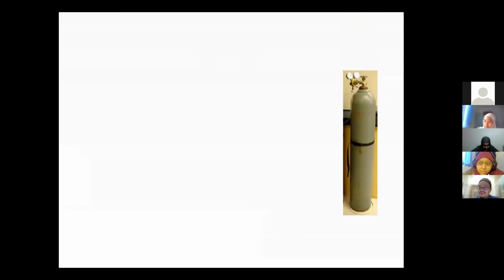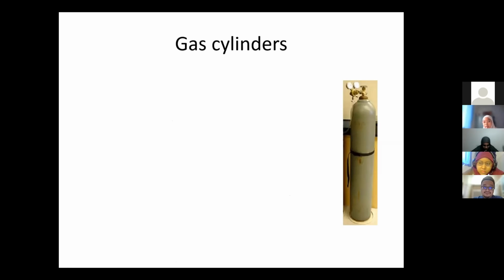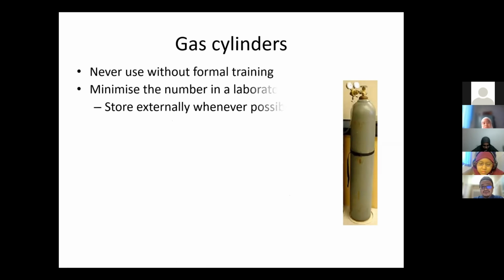Yeah. Okay, this is gas cylinders. Yeah, all labs will have gas cylinders. All labs that have cell culture lab, that have microbe labs. Yeah. Basically all lab lah. Saya tak boleh nak think of any lab that do not have gas cylinders in them. Yeah, they have to be used with formal training, and we want to minimize the number in the lab.